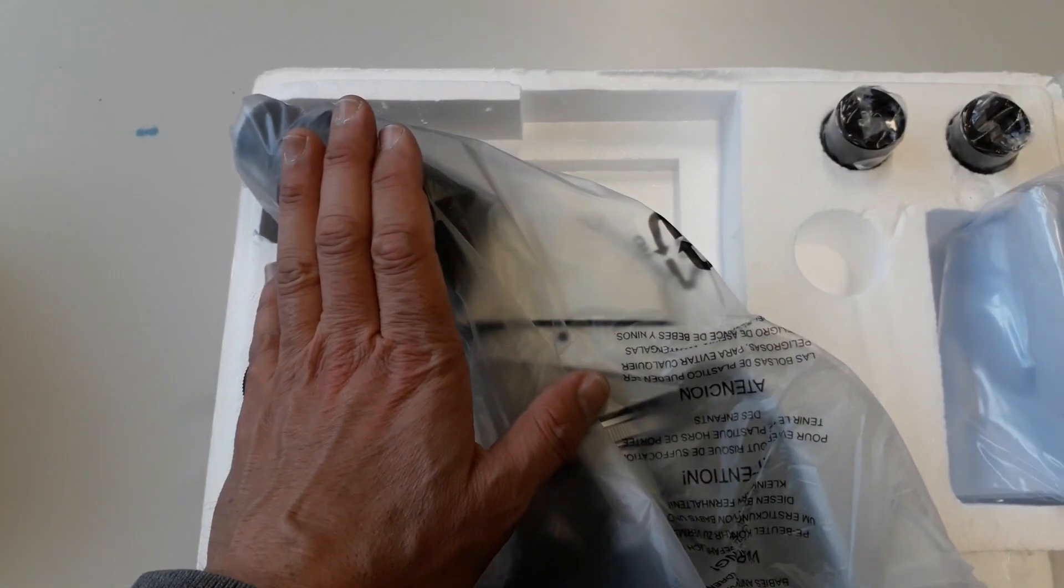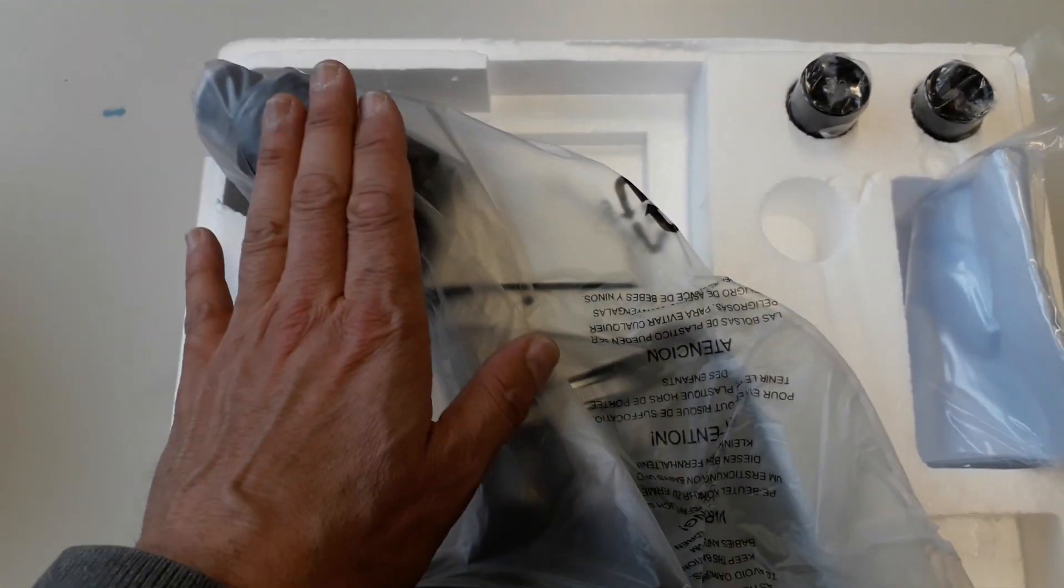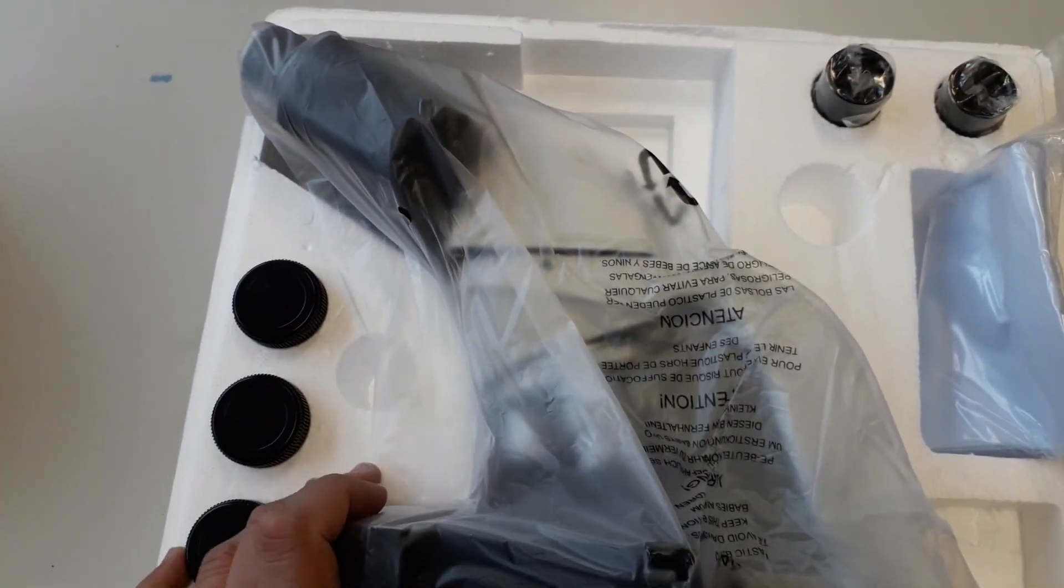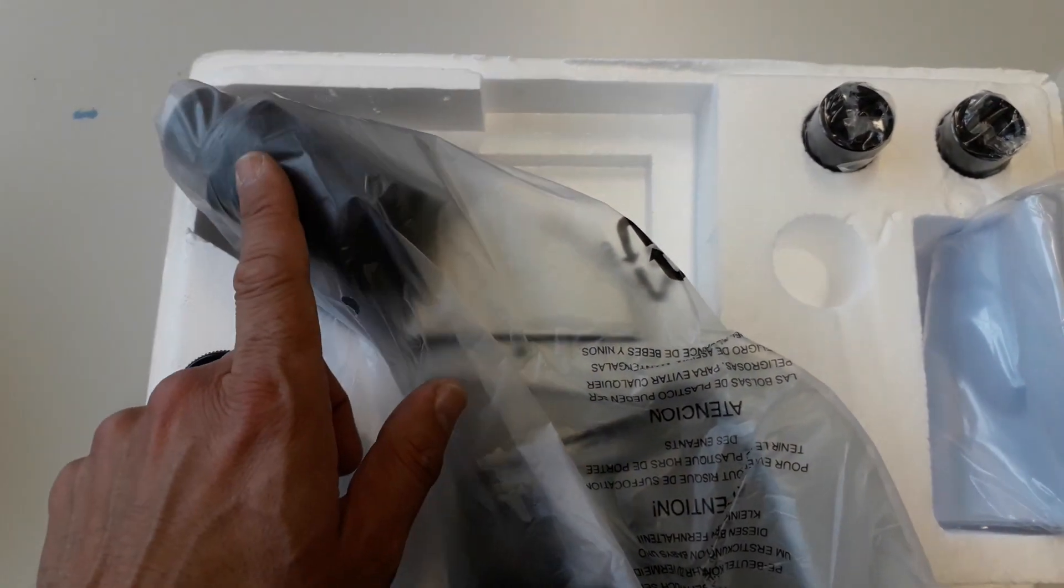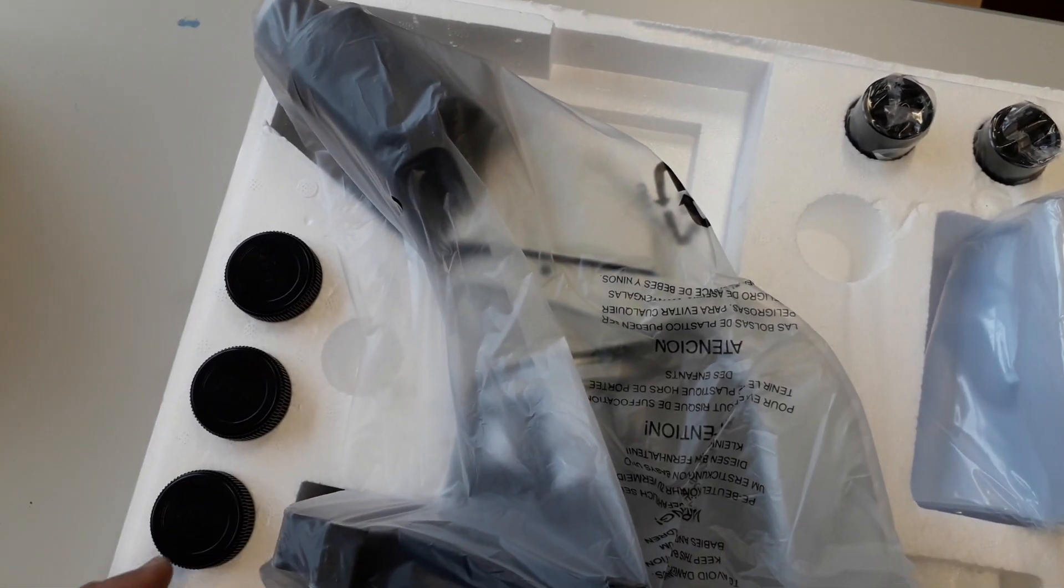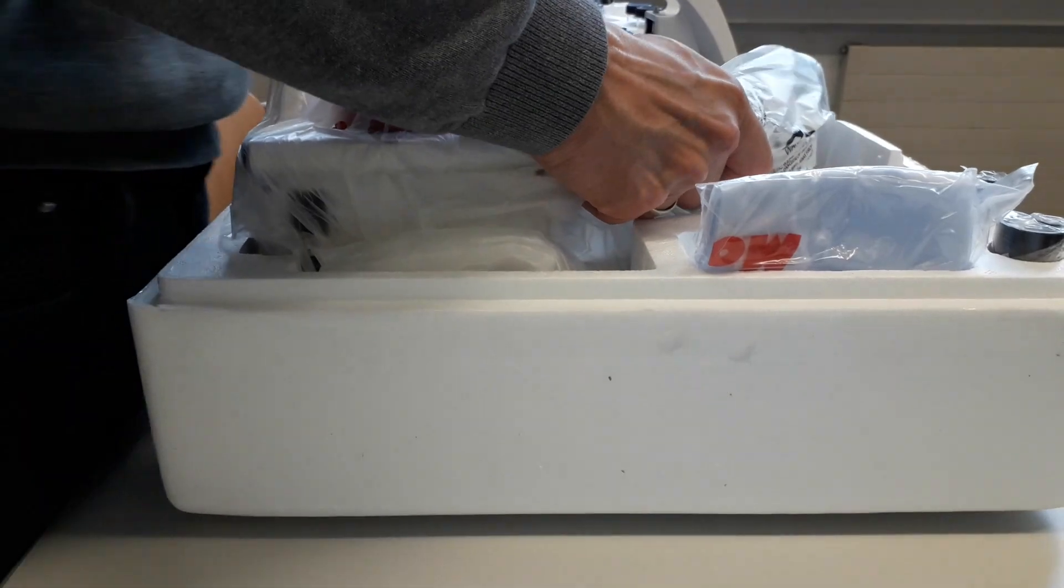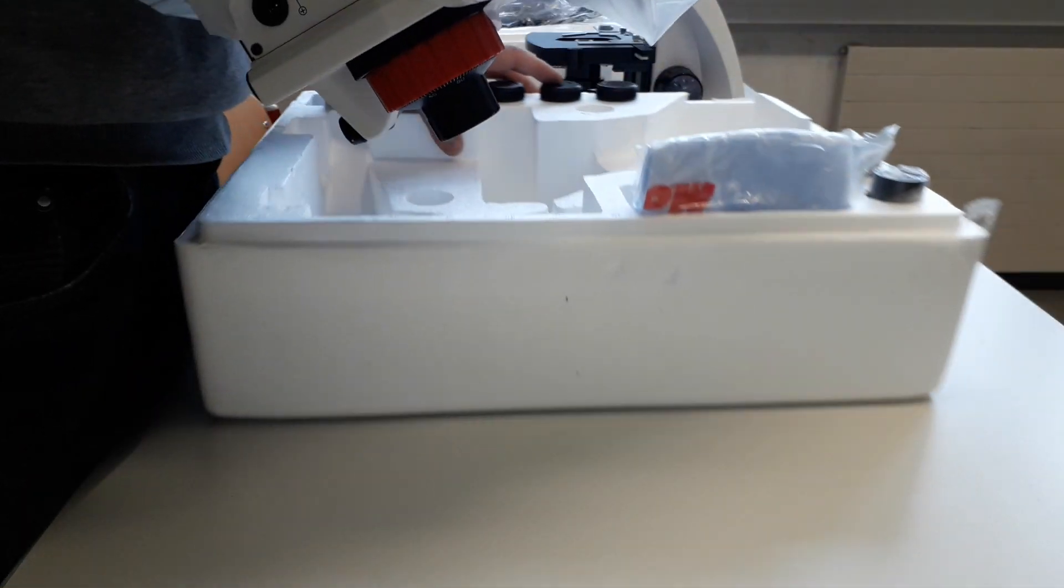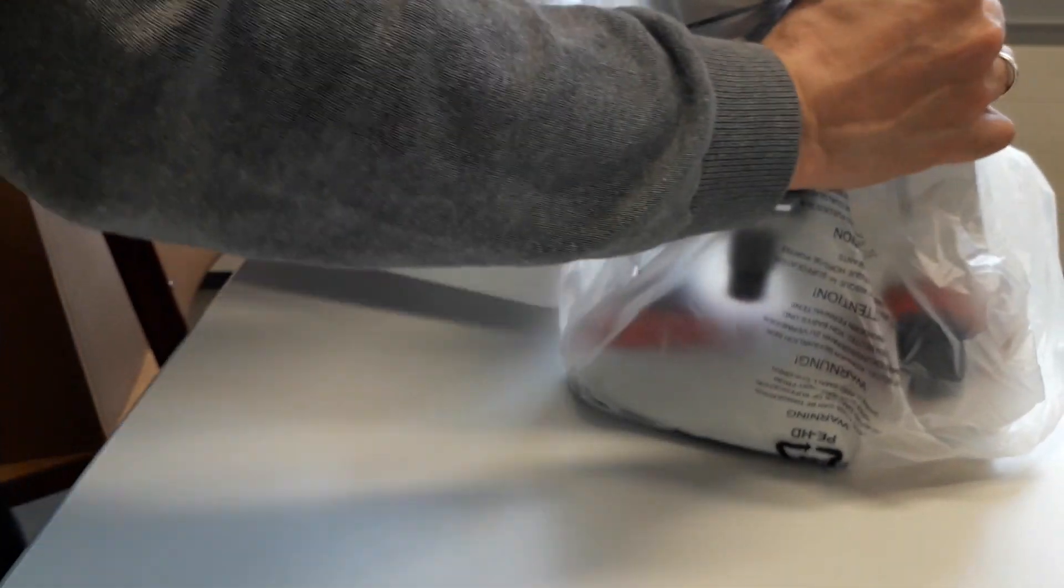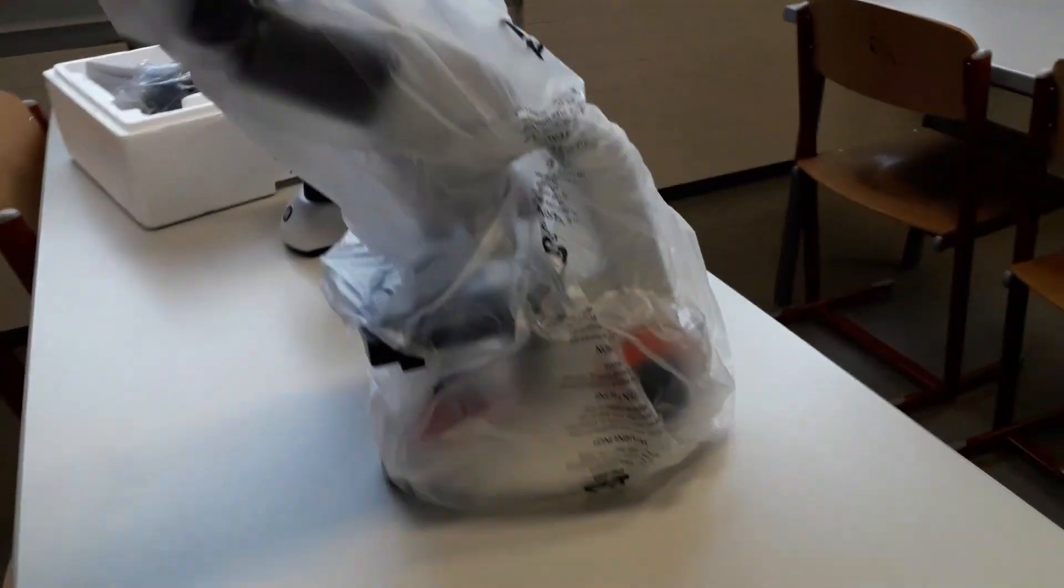Now this is a binocular version. They did not have the monocular version in stock, but we're ultimately going to get the monocular version if we decide to buy this one, because many students actually have a problem looking through with both eyes. And most of the time, they close one of the eyes anyway. This one is a little bit bigger. It's also a little bit heavier. So that's basically how this one looks like.